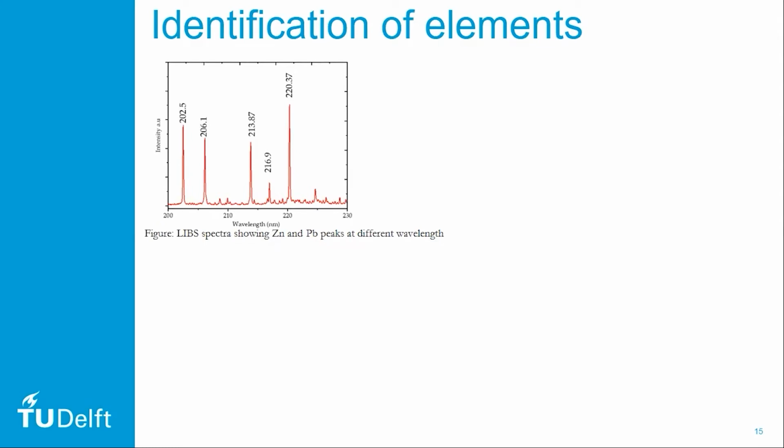Following that, LIBS spectral databases and published results were used to identify peaks that correspond to the elements of interest. Accordingly, the target elements were identified in most of the analyzed samples.